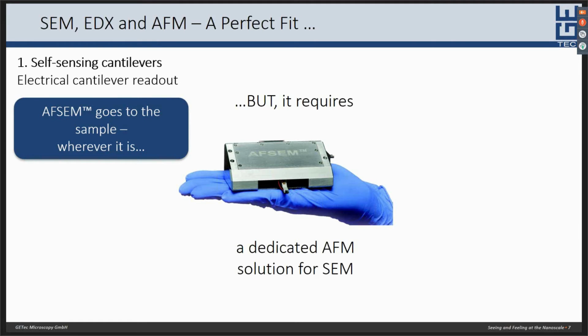First, we are not using the traditional optical readout for our cantilevers, but instead are working with self-sensing piezoresistive cantilevers. Due to the all-electric readout, we can go with the AFSEM directly to the sample under the e-gun, even for very small working distances.